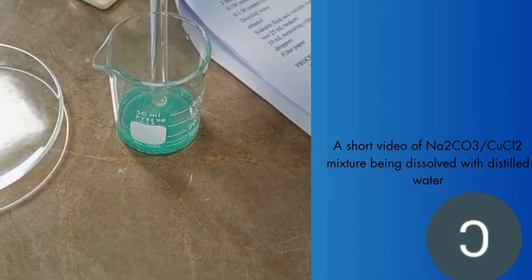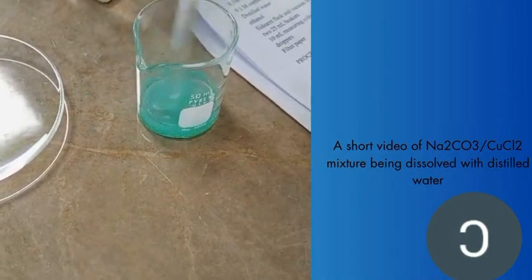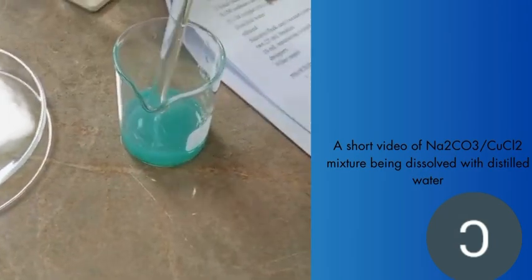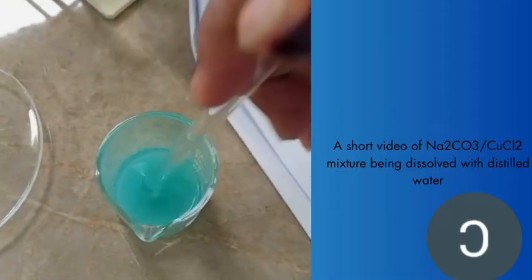So here we have a short video of the sodium carbonate, copper 2 chloride mixture being dissolved with distilled water.